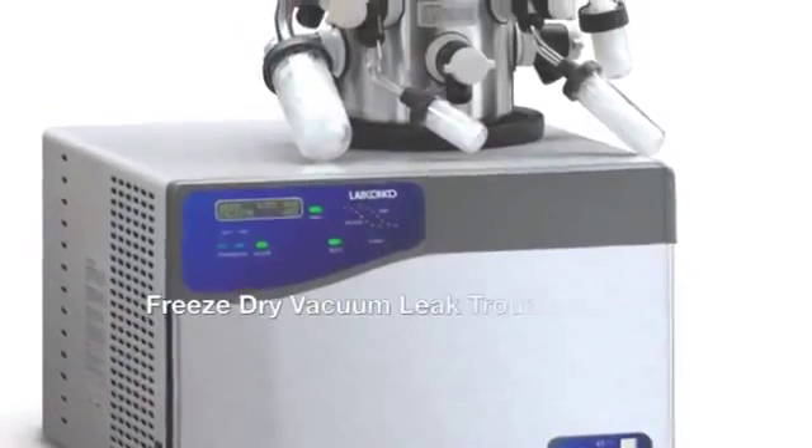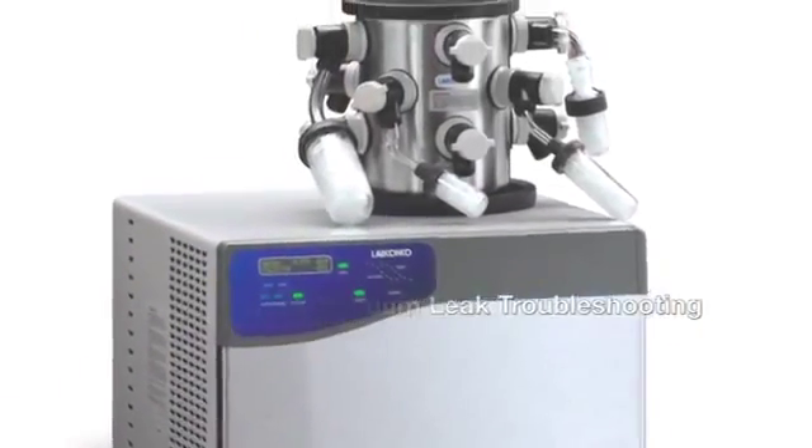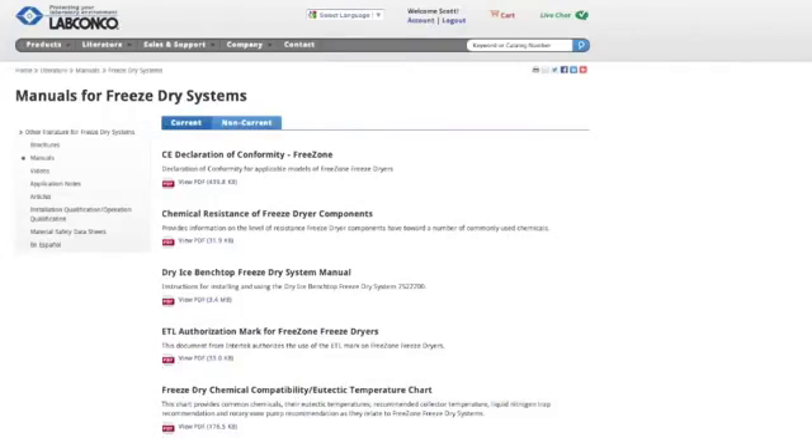A vacuum leak in a freeze-dryer can lead to poorly lyophilized samples. This video will make troubleshooting freeze-dryer vacuum leaks easy.